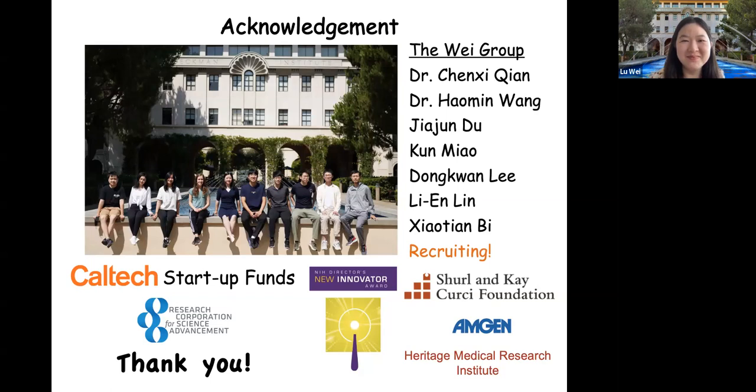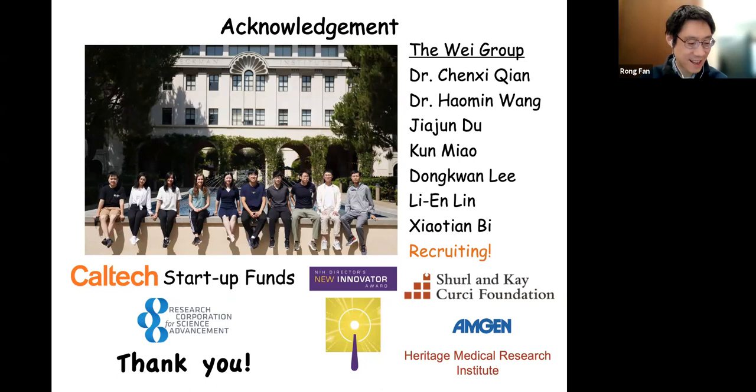Also, this reminds me of a talk I listened to about 10 to 12 years ago, in Greece, a beautiful island. Gary Nolan was talking about this before he started to work on CyTOF, using mass spec to do multiplexed protein analysis. He was talking about very interesting ideas using SERS nanoparticles and some Raman dyes to label cells and do multiplexed imaging or multiplexed flow cytometry using SERS. So I wonder if you can reevaluate the potential of this approach, or any other possibilities to further enhance your signal using something like field enhancement, right?